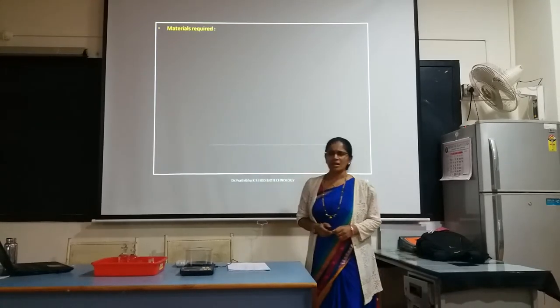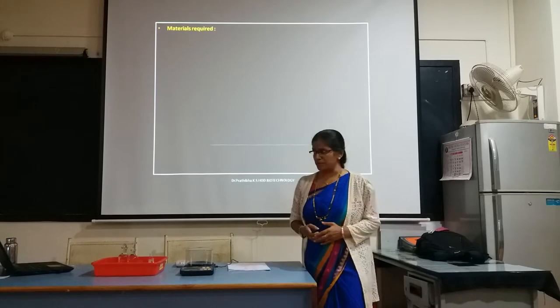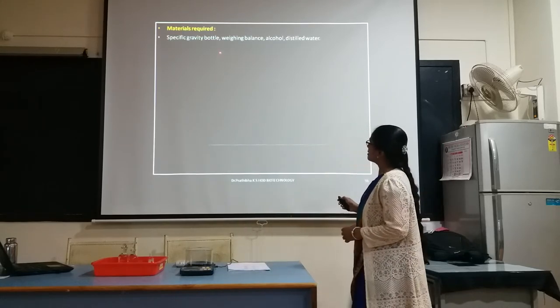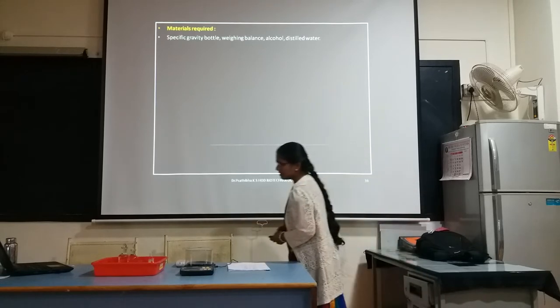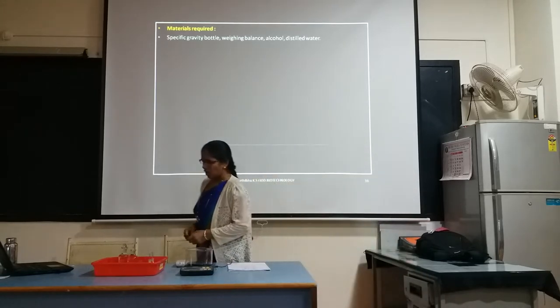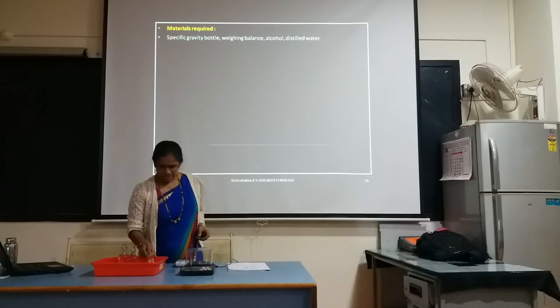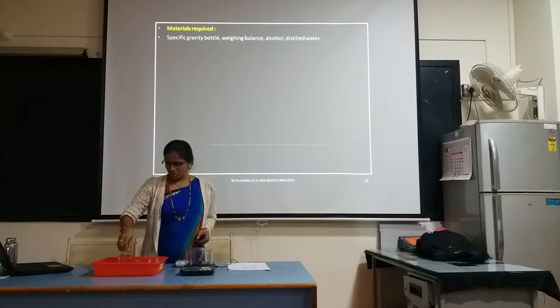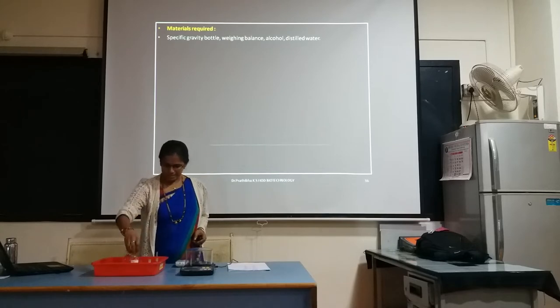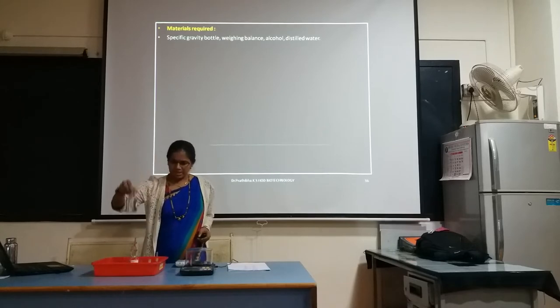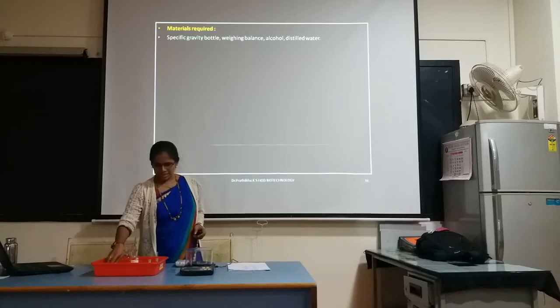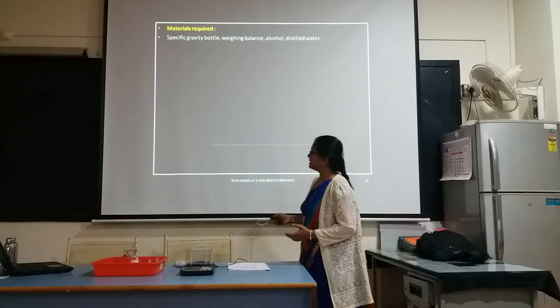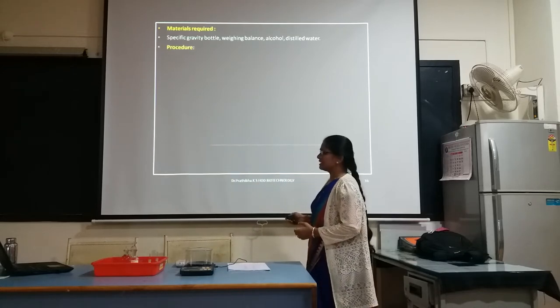Now let us go through the materials required for this experiment. First, we need a specific gravity bottle, a weighing balance, alcohol, and distilled water. I have kept them ready here — specific gravity bottle, alcohol sample, acetone to dry the specific gravity bottle, and blotting paper to wipe the outer wall of the specific gravity bottle.